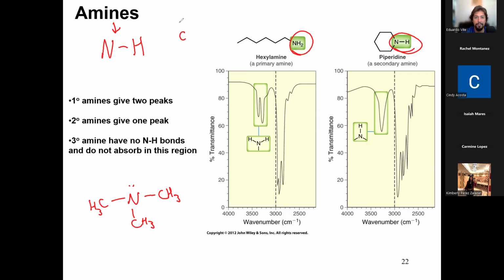So if you see this, and the R is just a placeholder, it could be anything, right? But this could be NH, this could be NH2, this could just be N and some carbons. This whole thing is called amide because it has the carbonyl. Okay? So if you see the word amine, you're specifically talking about the NH. Any questions about that? Very similar words, one letter difference. That's why.